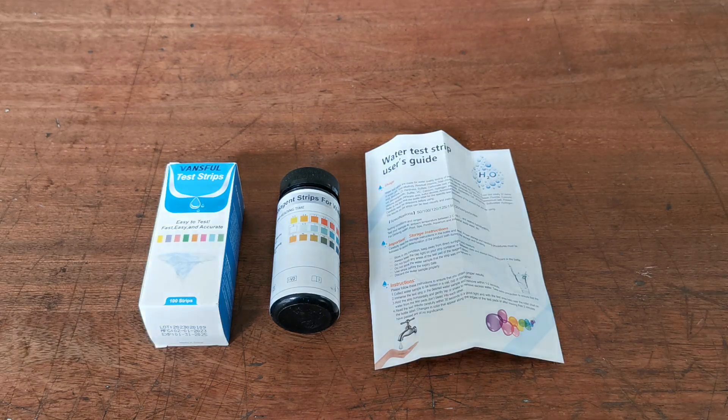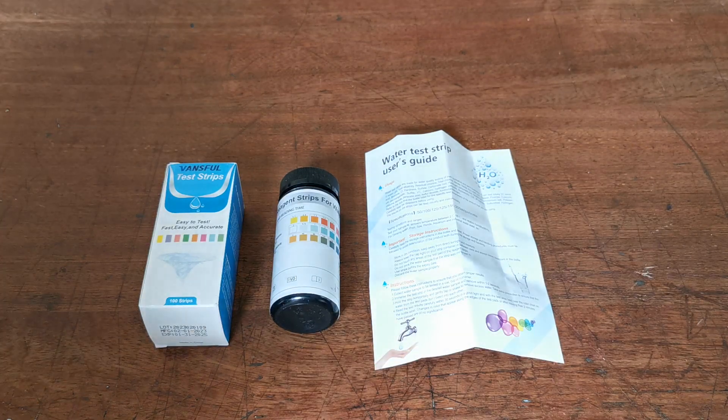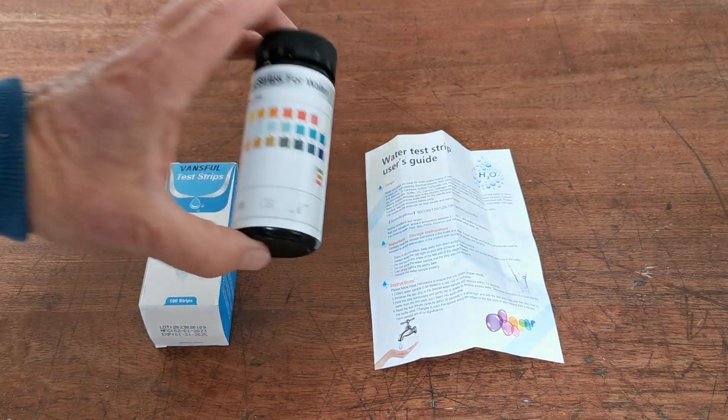Welcome to this volume of presentation. We're going to show you what you get in a pack of Vansful 3-in-1 spa pool or swimming pool water test strips. Testing the water quality — the free chlorine and the pH — are the two key elements you want to get right if you're using chlorine granules, which most of us are in the UK, for maintaining healthy water quality in a spa pool. These are ideal for that.